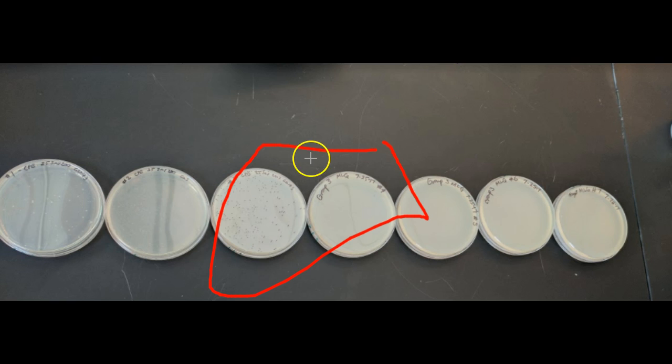You might see here that we actually drew on the lid with a Sharpie to count them. You don't want to do this right away because you want to be able to see them, but that's a great way to count them. You can always remove the Sharpie with alcohol.